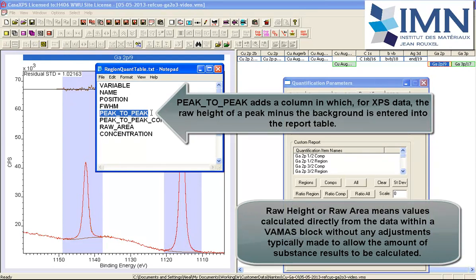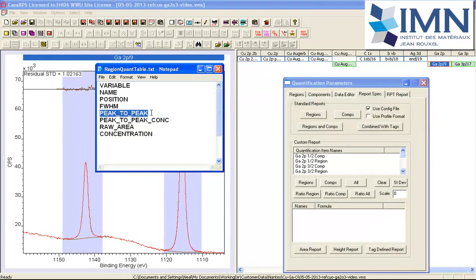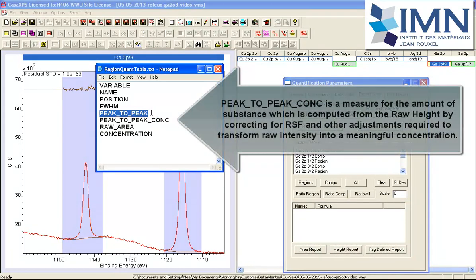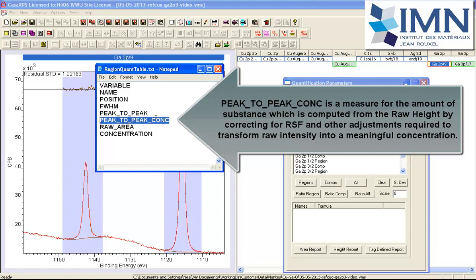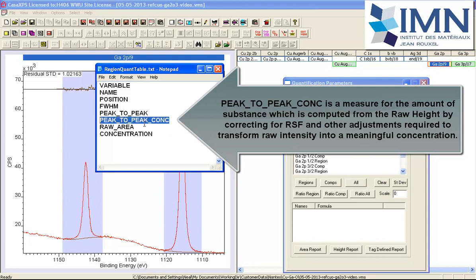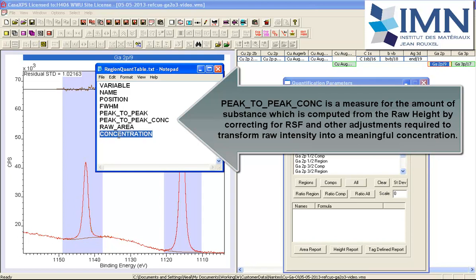I've also indicated peak-to-peak, and this is the one that is of particular interest in this video. We are going to extract the height of a peak above the background using peak-to-peak and using the standard report to do so. I've also included the peak-to-peak concentration, which will be calculated based on the peak-to-peak height, but other adjustments to the peak height will be made based on relative sensitivity factors, transmission, escape depth. They all go into creating this concentration, just as in the case of the raw area. Similar corrections will be made to generate a concentration based on the peak area.